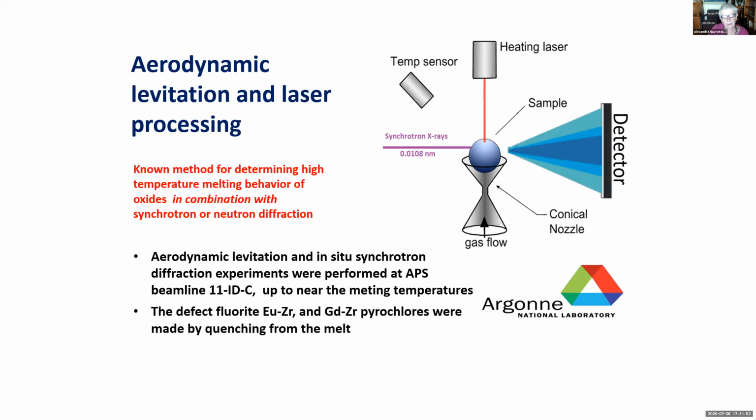One of the ways of eliminating the problem is to eliminate the container. And it is now fairly easy using commercial levitators, particularly aerodynamic levitation, which is the easiest, simplest, and cheapest, but also one can do electromagnetic levitation, etc., at least for things that show high thermal and electrical conductivity.